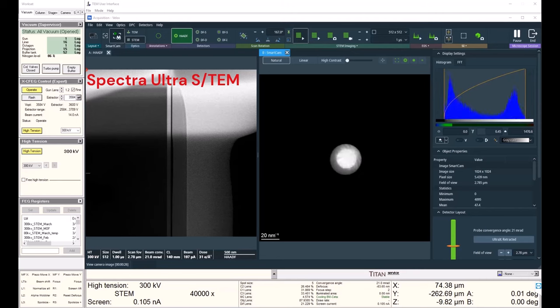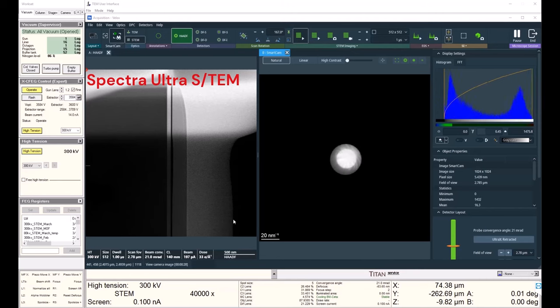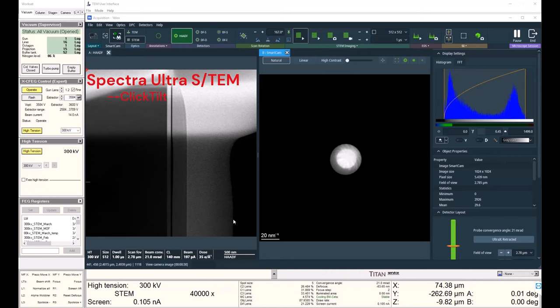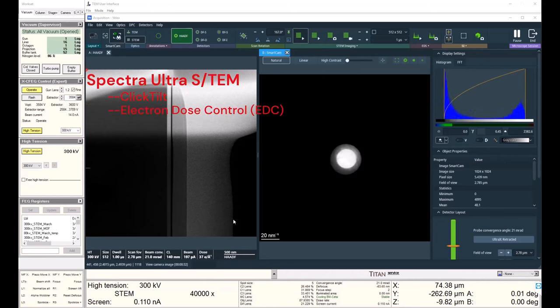Hello everybody and welcome to the Spectra Ultra. Today we're going to be talking about our double-click tilt functionality, our electron dose control module, and the Ultra X EDS detector.